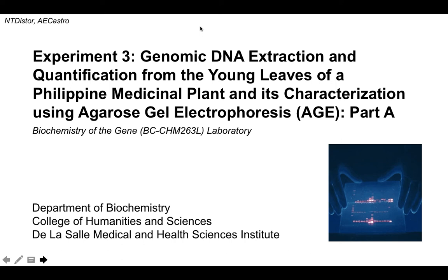Good day, class. Today's laboratory session will be about the extraction of genomic DNA from plants of medicinal value. The growing interest in traditional and alternative healthcare led to the increased attention that medicinal plants are receiving in terms of their potential as sources of bioactive compounds that can be used as treatment for certain medical conditions.